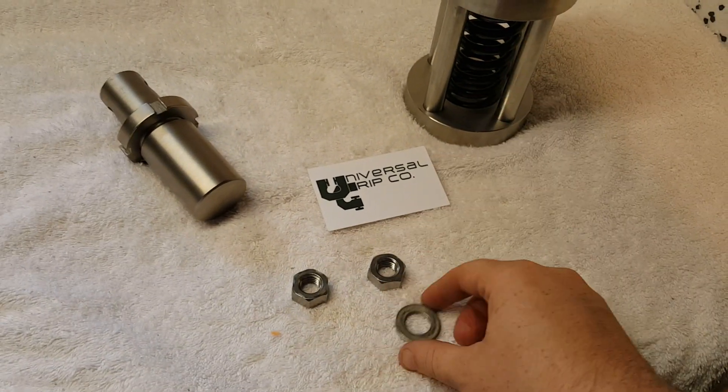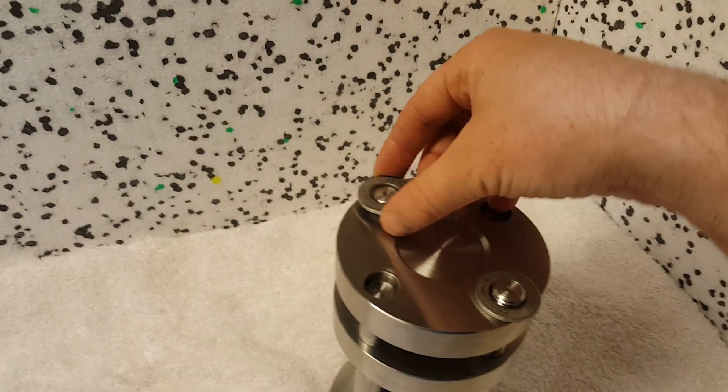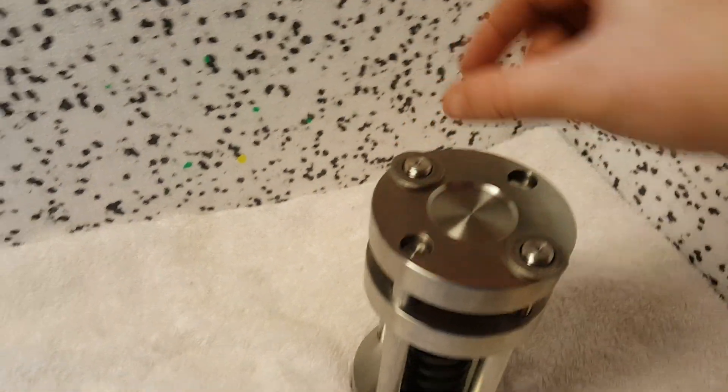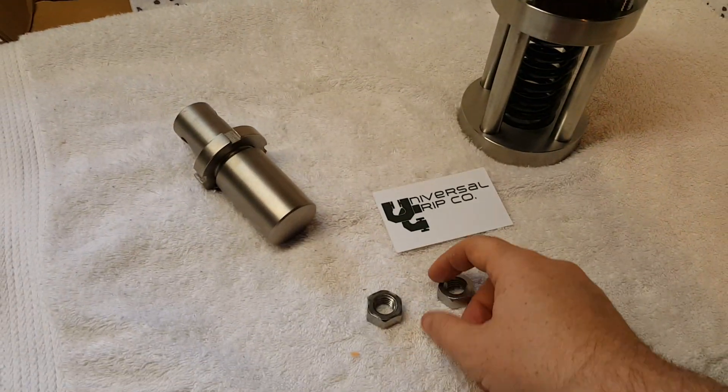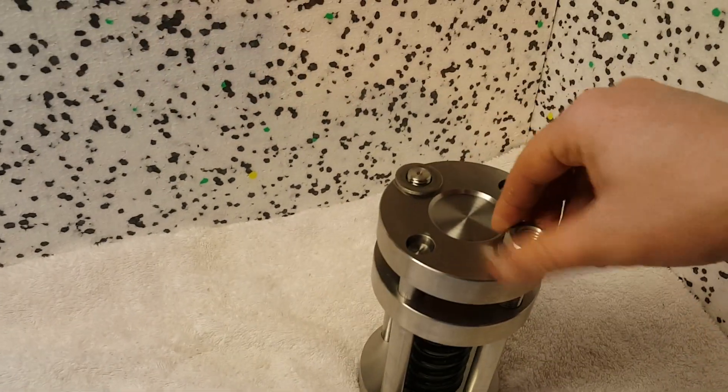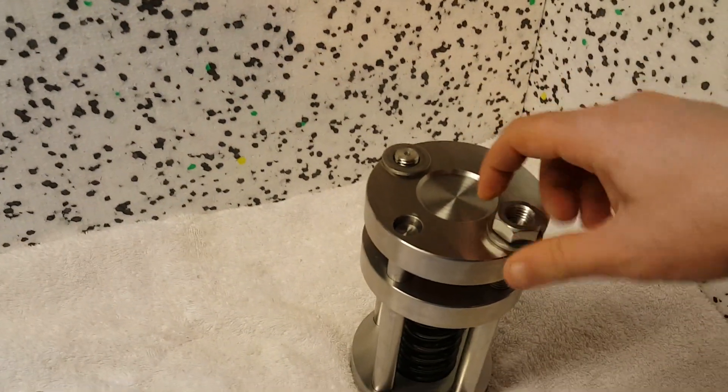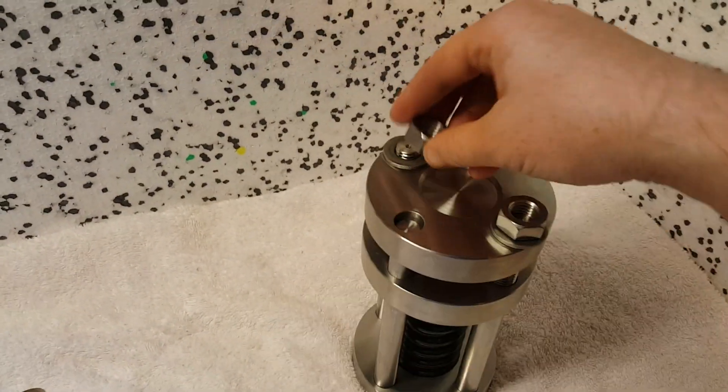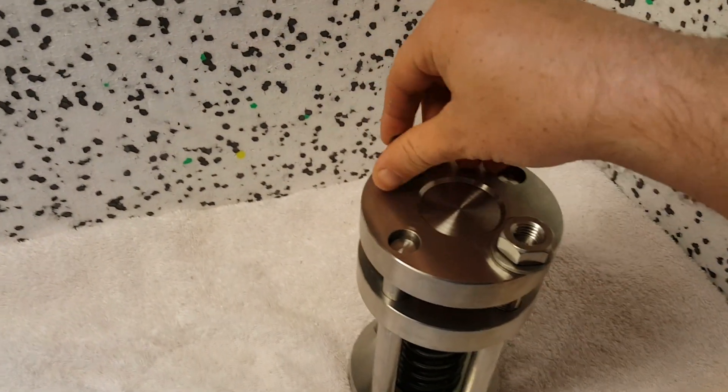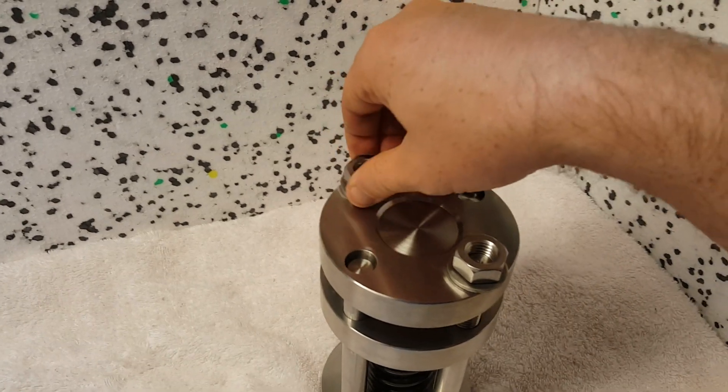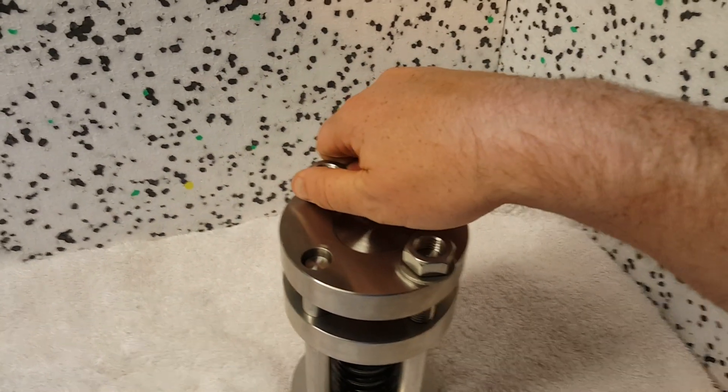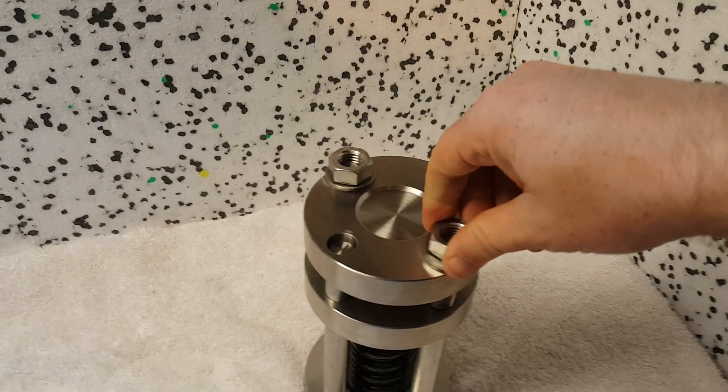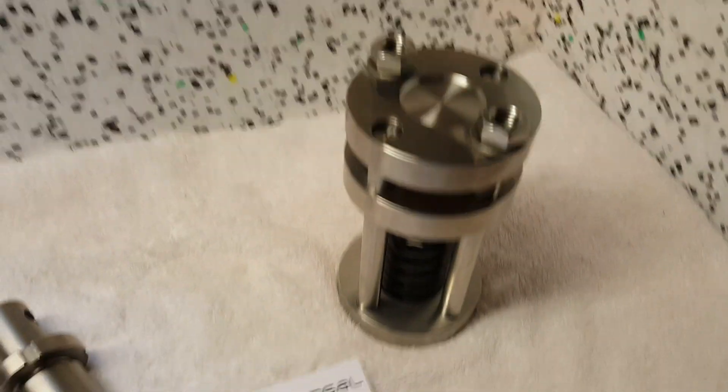Then I have these washers and nuts that just go on top like this. You can go ahead and tighten that down with a wrench.